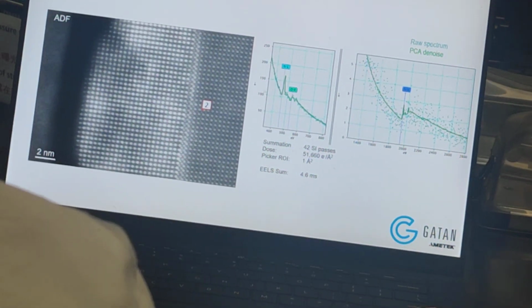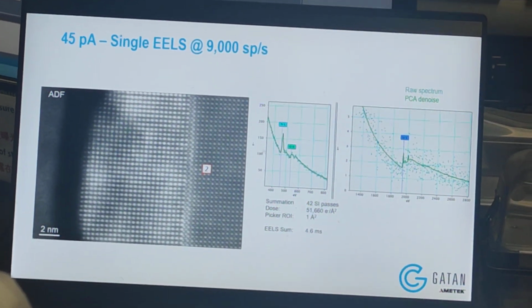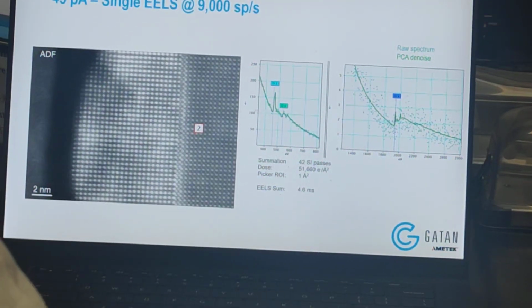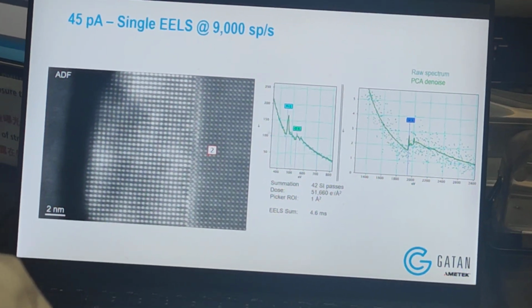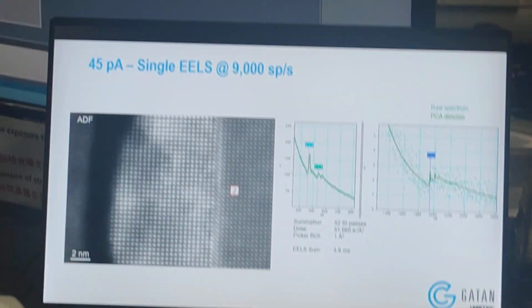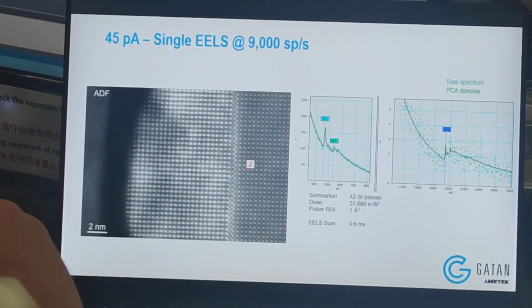But are you having an issue with a specific experiment, or is it just a question of curiosity? Yeah, we try some high energy, more than 1,000 for sure, sometimes 2,000, not that high, but I just try to optimize as much as possible. The problem there is, for the EMCD, we look into small features and we try to make sure the spectrum is well focused and also the energy resolution is not affected.